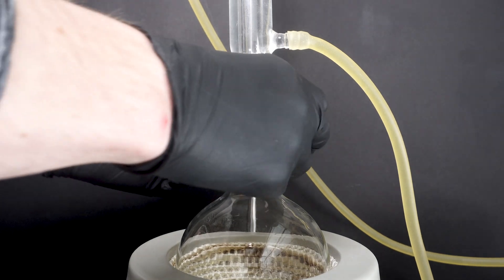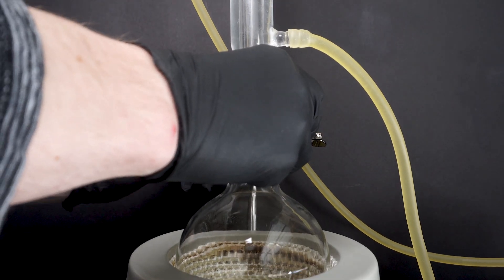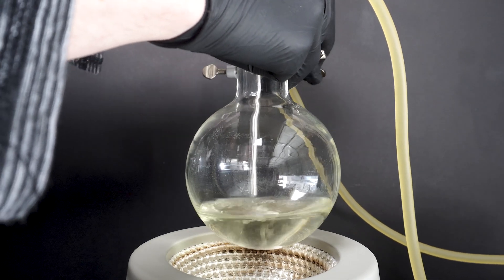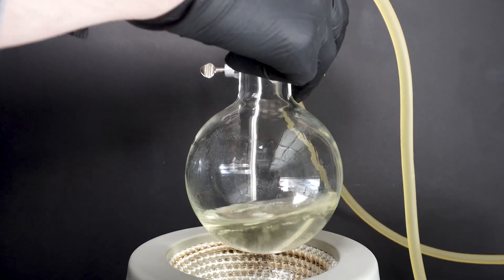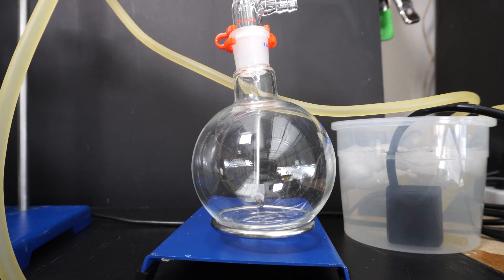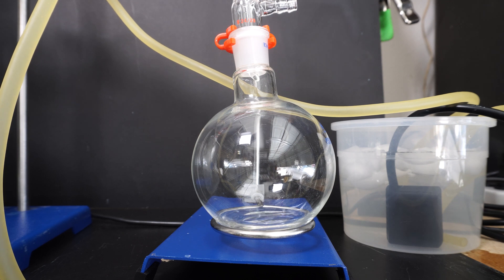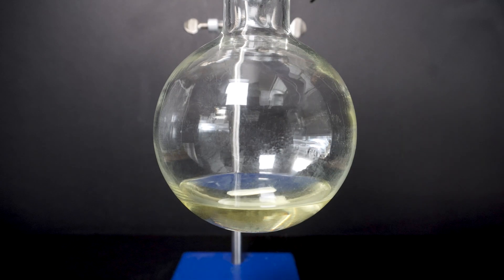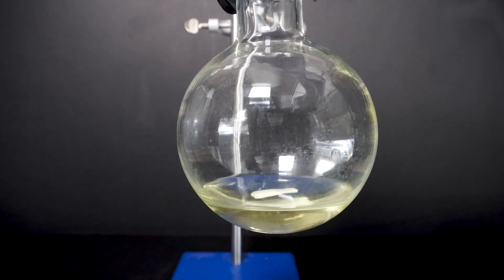Once refluxing is complete I raise the flask — we can see it's still refluxing slightly — and then we just need to wait for it to cool. Now we need to remove about half of the overall methanol in the solution. To do this I set up a simple distillation, knowing that methanol has the lowest boiling point and will be boiled off first. We can see crystal clear methanol coming over; however it still has a strong odor of methyl salicylate so I can't just add it back into my stock. After the distillation was completed we can see a small layer of methyl salicylate on top of the methanol.